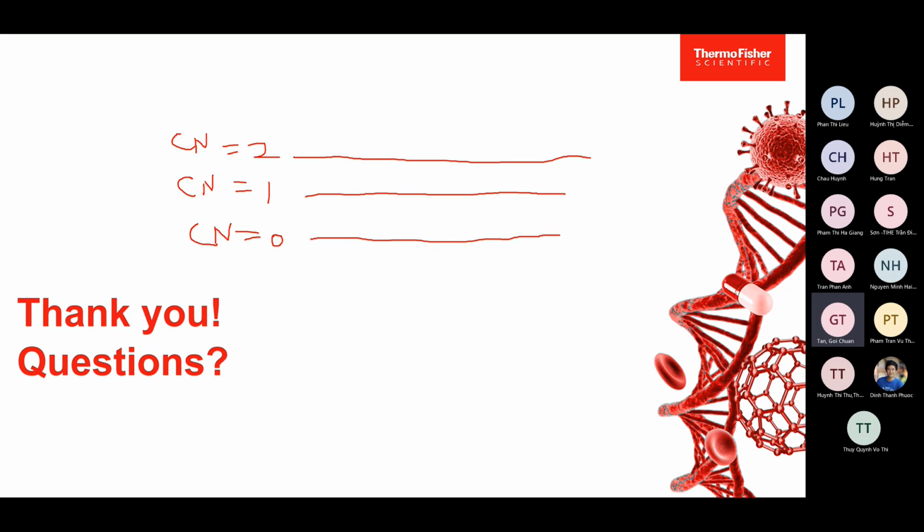During the development time, we genotype a lot of samples, and then we know for that particular sample what the copy number status is: copy number 0, copy number 1, or copy number 2. So we already have that background or reference signal. And then once you genotype your actual sample, they will compare your actual sample signal with the reference.